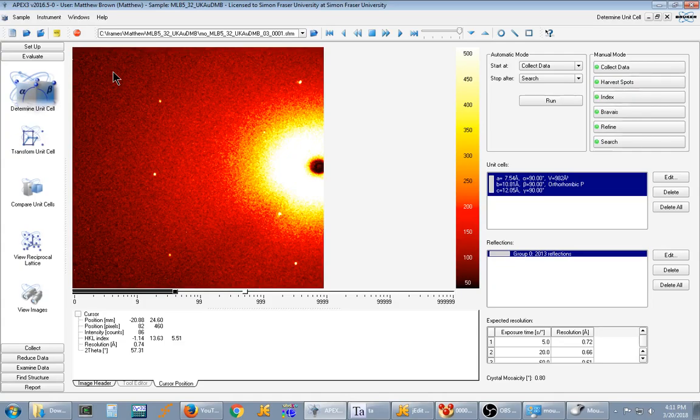So I discovered this after accidentally running a known ligand because the separate computer we have the full Cambridge Structural Database license on was broken.